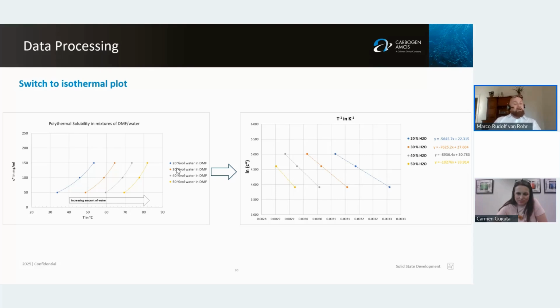That's something I saw in the melting of a substance, because it seemed to be completely decoupled from whatever we do. It always dissolved at 60 degrees Celsius, and then we recognized that it's melting. During this melting process, things can happen. But often, when I see something weird happen, block formation or coating, that's linked with the nucleation part. Yes.